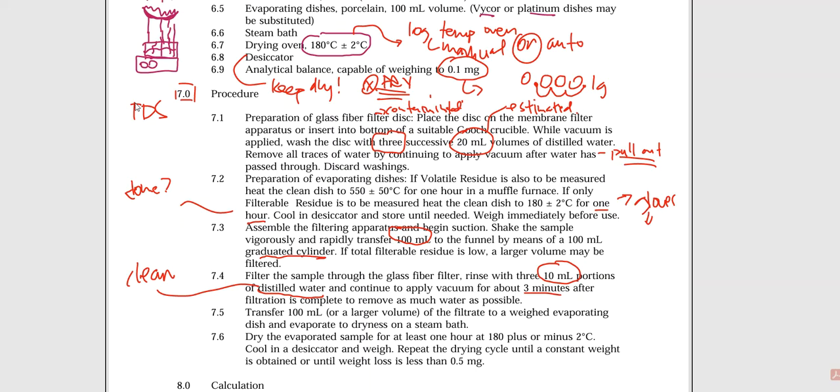So in a weird way, it seems like we are adding to the contamination with these rinses, but folks, we are not. And the reason is because they shouldn't have anything in the first place. That is why we're using them in order to rinse. So that means no tap water can be used because tap water has contamination. That contamination is going to fall through, and that contamination is going to end up being in that evaporating dish, and it's going to add to the residue numbers, and I can't allow that to happen. So again, be very, very particular with the water source that you use.